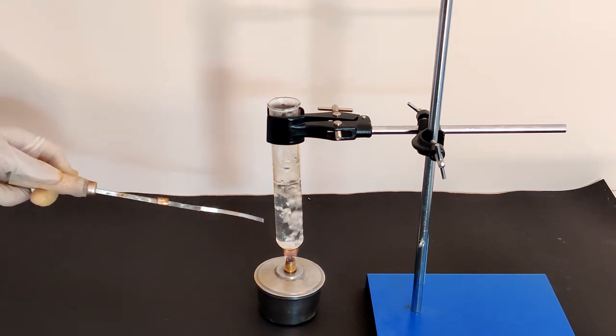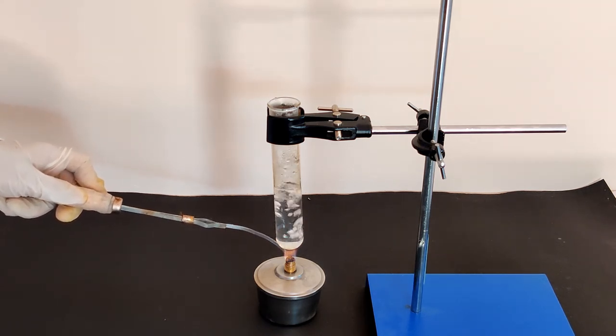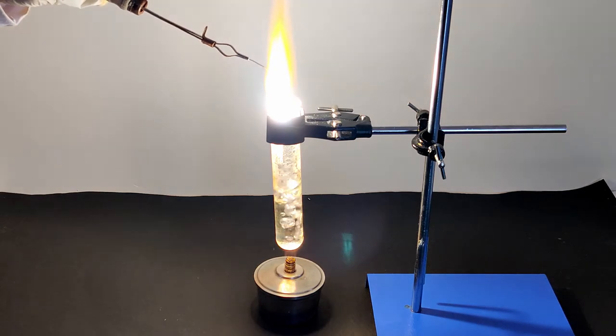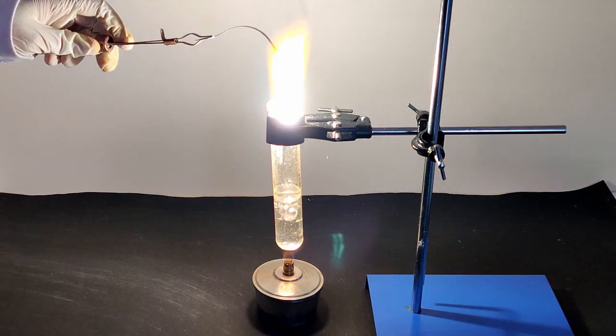Attach the piece of magnesium ribbon to a test tube holder and light the ribbon till it catches fire. Quickly lower the burning magnesium ribbon into the test tube, exposing it to the steam. You will notice the magnesium ribbon glows more vigorously when lowered into the test tube.